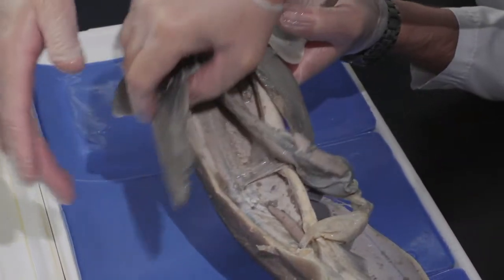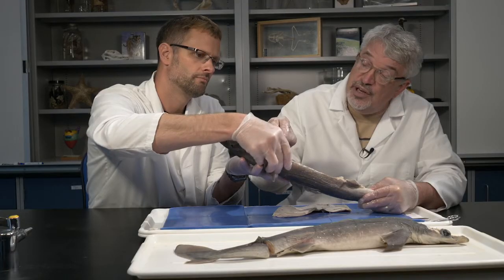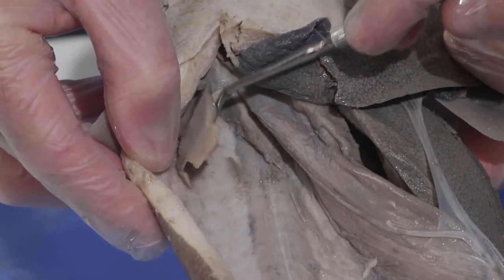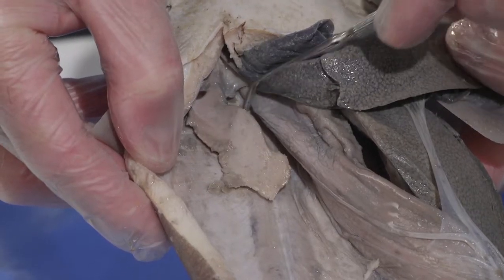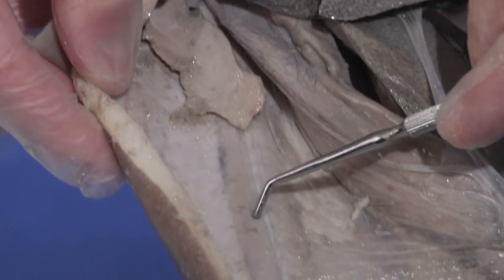As we move that to the side, the real differences with the male are the urogenital system. Up near the pectoral fins at the top of the body cavity are a pair of testes — these white smooth-looking structures, one on each side. There's a duct that transfers sperm that runs down the surface of the kidney.